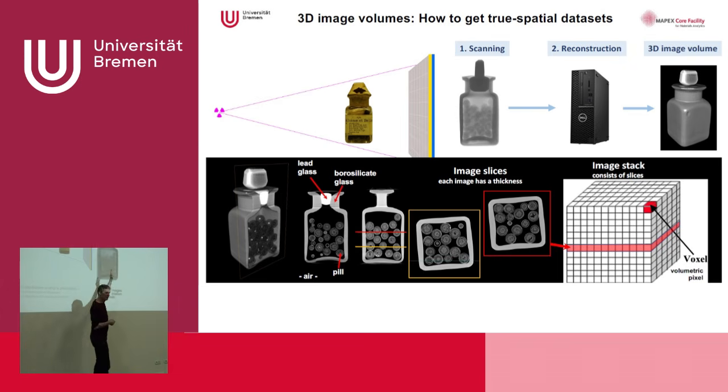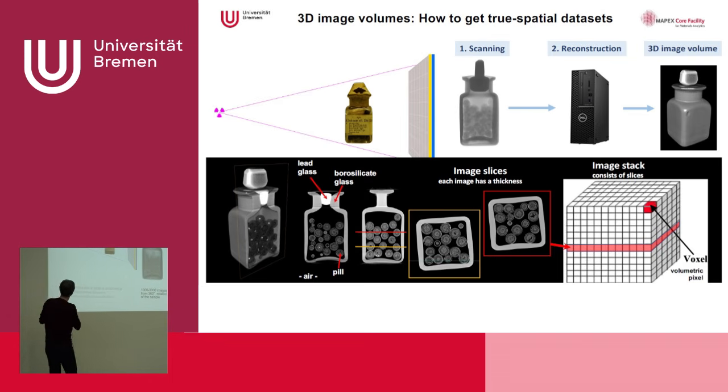in several rotation steps, and we see this image has a kind of perspective. We have a point-focused X-ray source here, then you got a beam, and on the other side you got a detector, and this kind of sample is just bathing in the X-rays. And it has a kind of cone beam, it has a kind of perspective here, because in this direction you have a magnification.